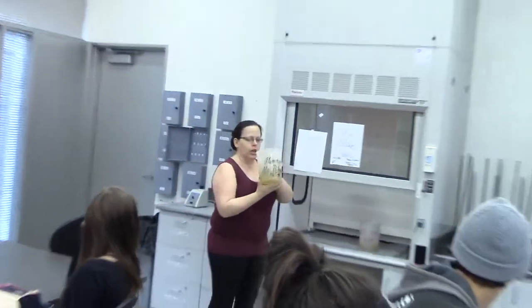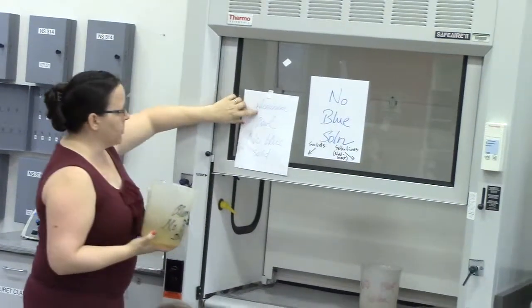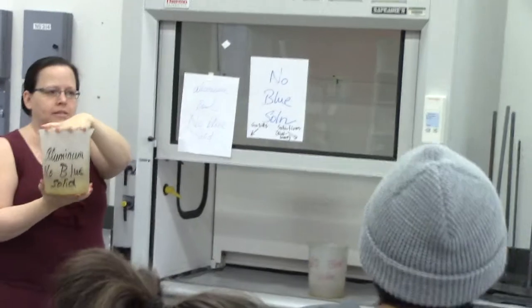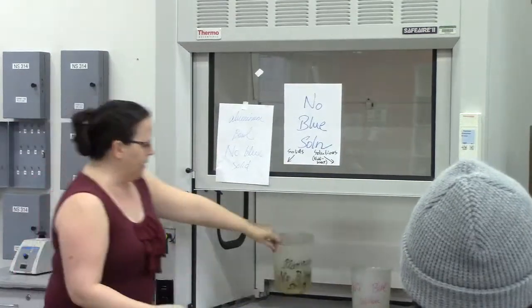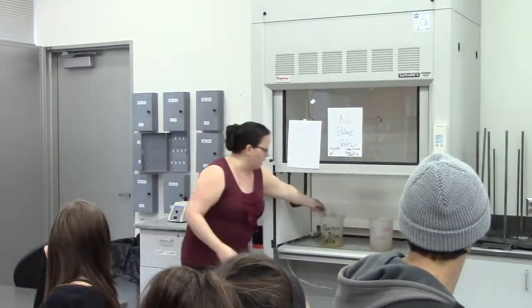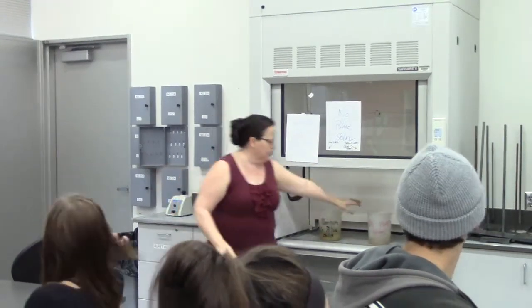One says aluminum, no blue solids, okay? Any aluminum foil pieces, any solids that are not blue in color, all get to go in here. So my little aluminum foil square that has the sugar on it, the whole thing goes in there. Because it's a white solid on the aluminum, that goes in there.